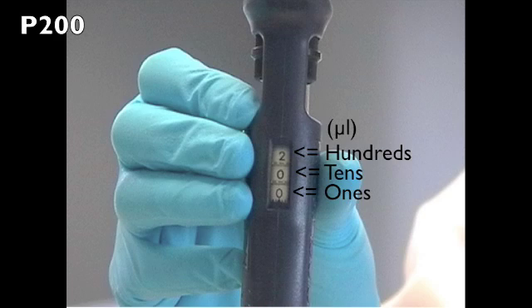On the P200, the first number displayed represents hundreds of microliters, the second number represents tens of microliters, and the third represents ones of microliters.